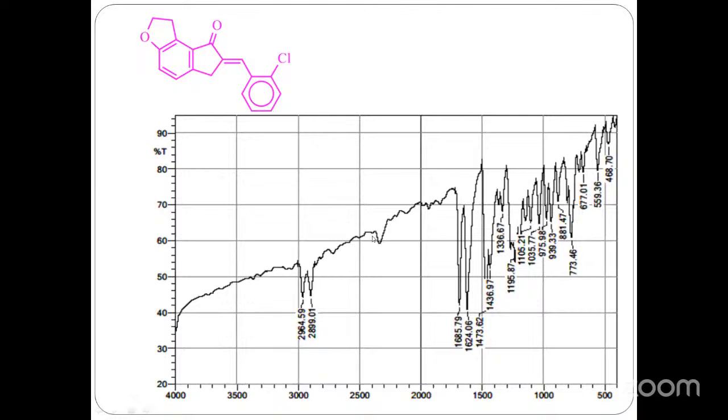It is due to carbon dioxide, which is not labeled in this case. And in this spectrum, there are no signals due to moisture, water molecules. All other signals, carbon double bond carbon frequencies, you can see there is a carbon single bond oxygen.